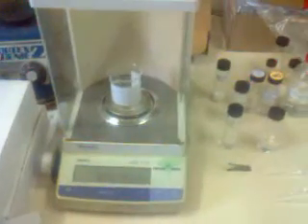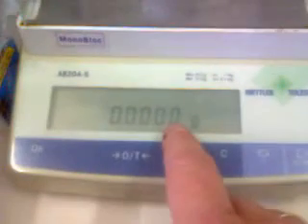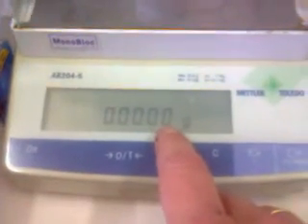I'm going to test water. Over here is a pretty accurate balance which measures up to ten-thousandths of a gram. Here I have water, and here is another bottle of water. Let's see — I'm going to test this and see how consistent it is.